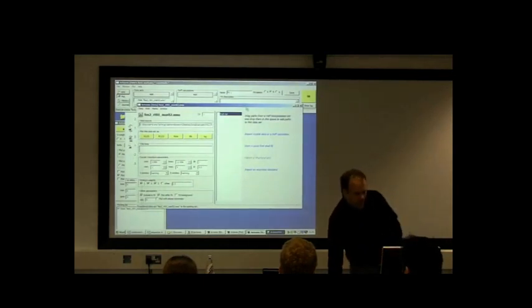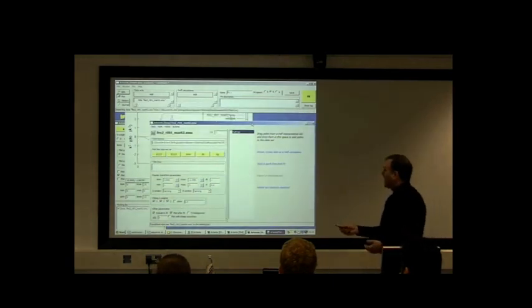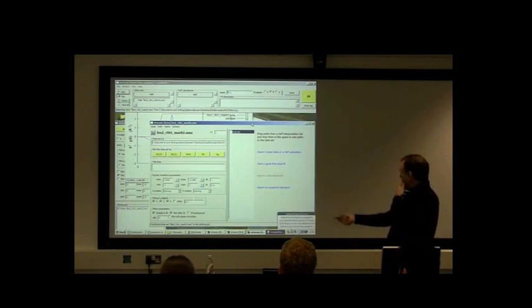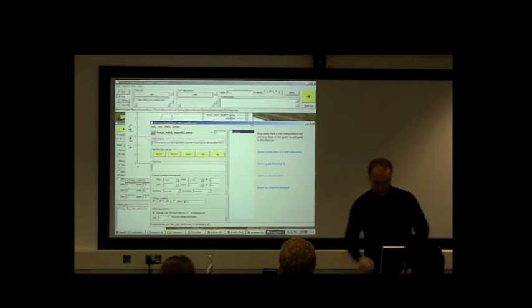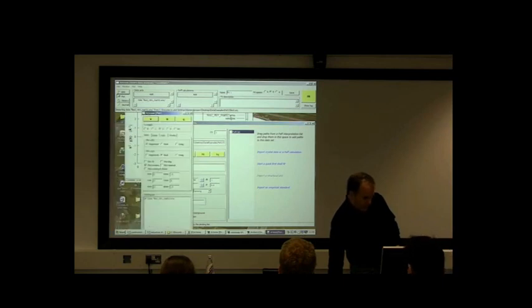This window has two sides. On this side is unable to reconnect to the session. Please verify that you're connected to the internet. Well, I'm going to do that. See if I really am connected to the internet.